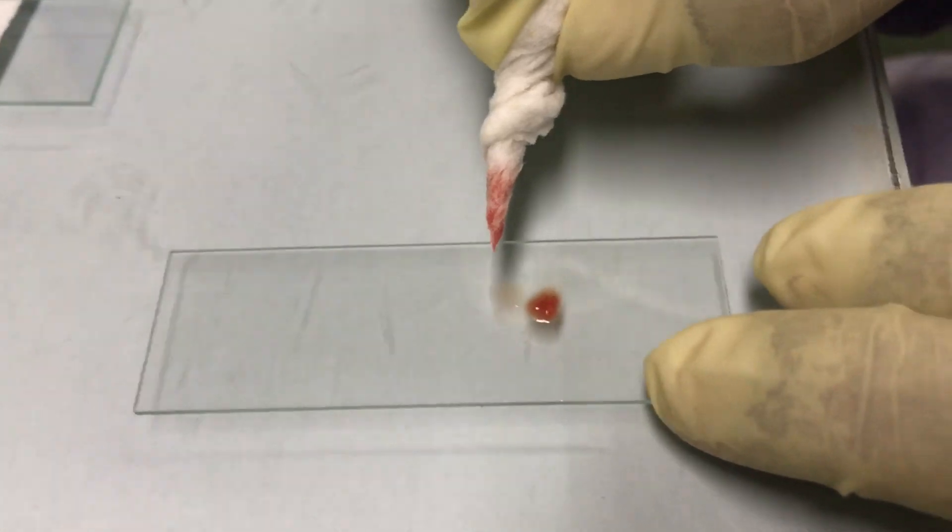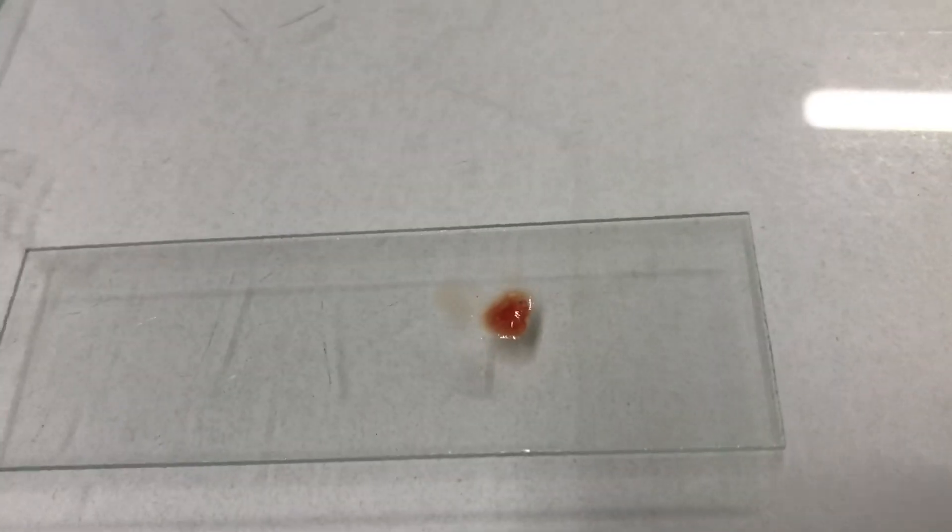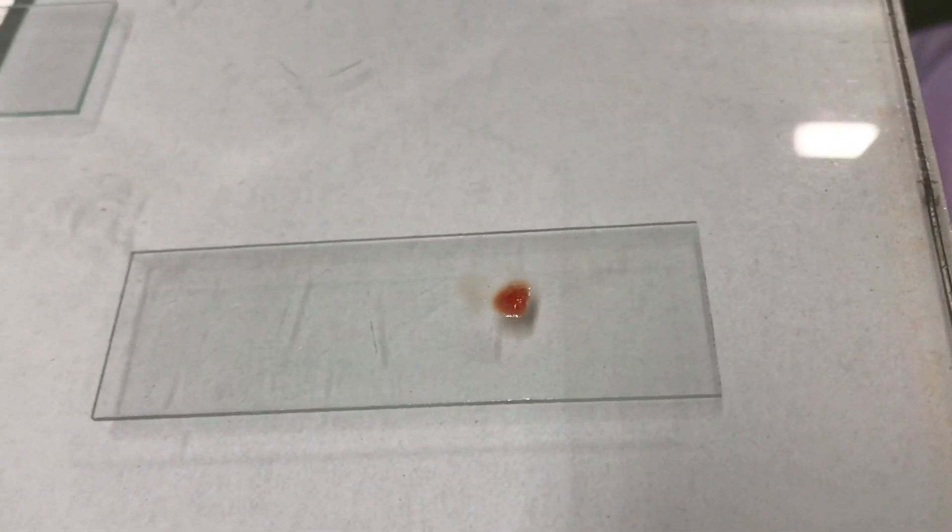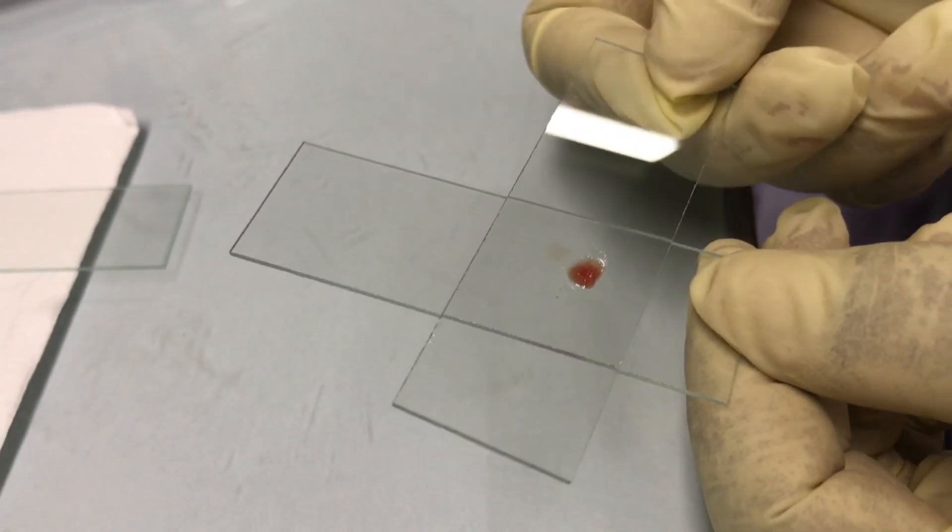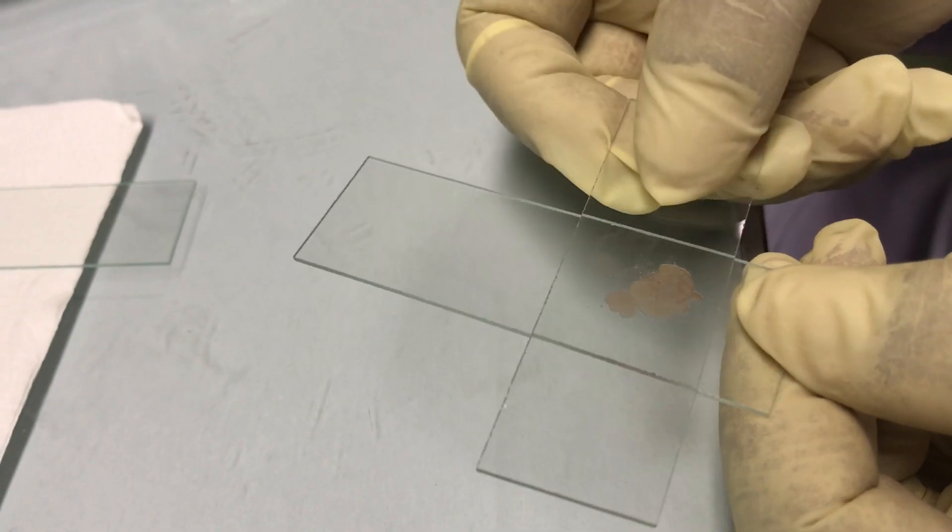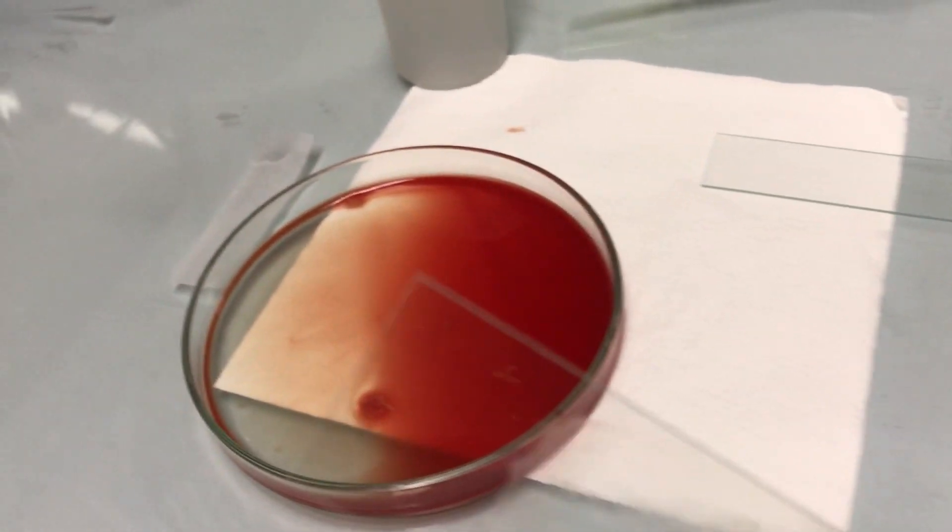Now the glass slide contains only marrow particles. We are using another slide to make a thin smear of marrow particle on the glass slide.